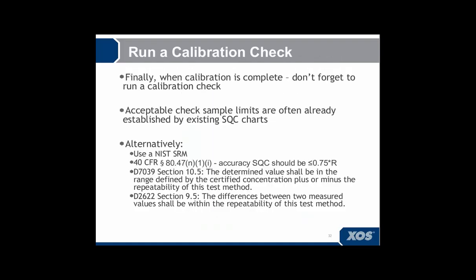Next, your calibration is finished. The last thing you want to do here is to run a calibration check. This tells you whether your calibration is good or not. I do often get asked, what is an acceptable limit for this check sample? Well, here are some options.